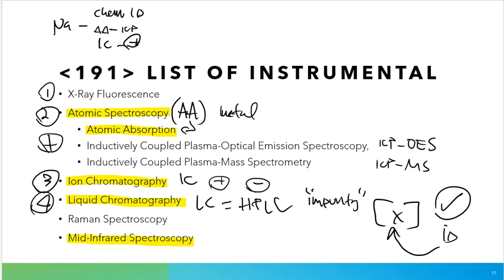Next up, number 5 is Raman spectroscopy. We don't really do too much with that at all. We just don't really even talk about it or discuss it.